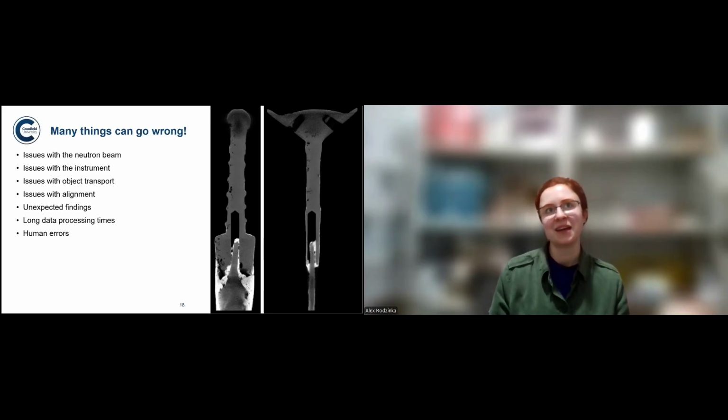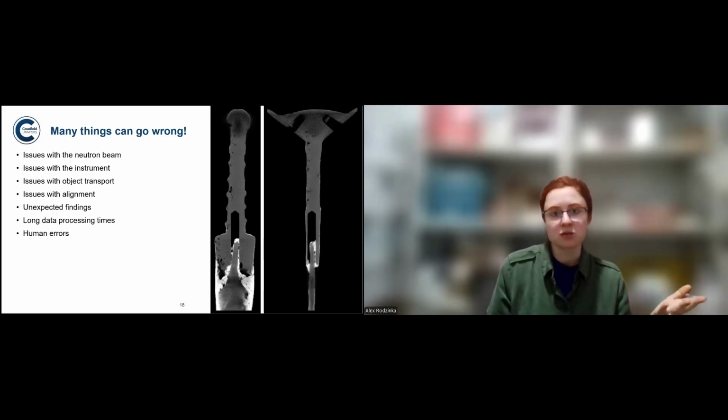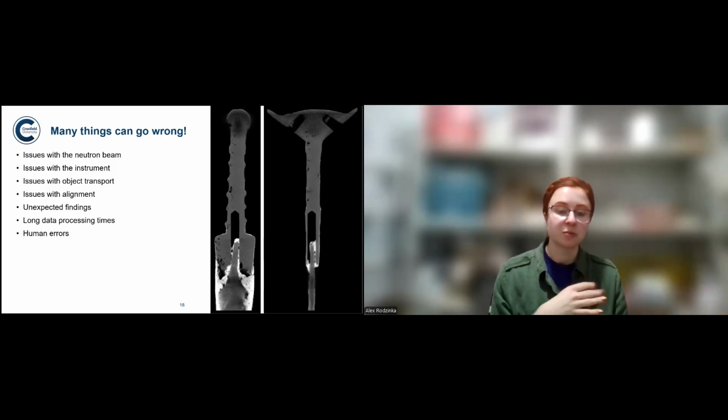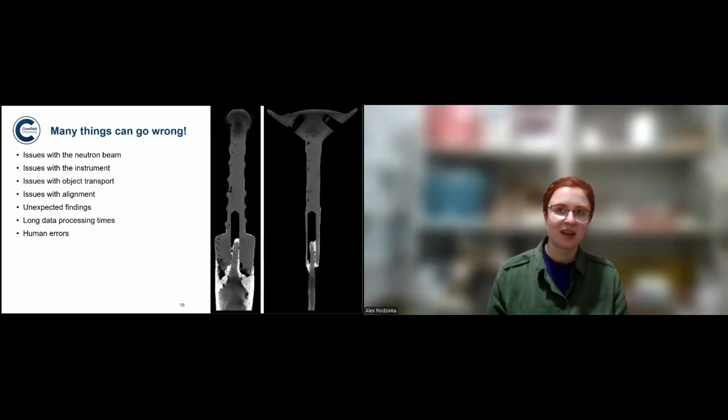Because, for example, you might find high levels of an element which will make the source more irradiated, because neutrons do irradiate the object, but in the case of bronze or iron, after a few hours, even less, the object is safe to touch and safe to be moved and perhaps sent back to the museum. But if you have something like very high levels of arsenic, and you suddenly irradiate the object, then that can extend to many days.